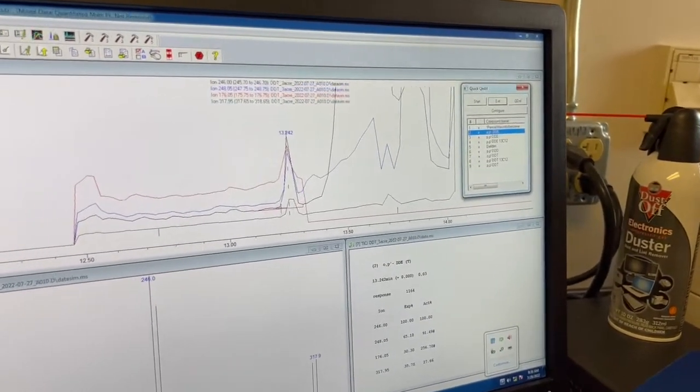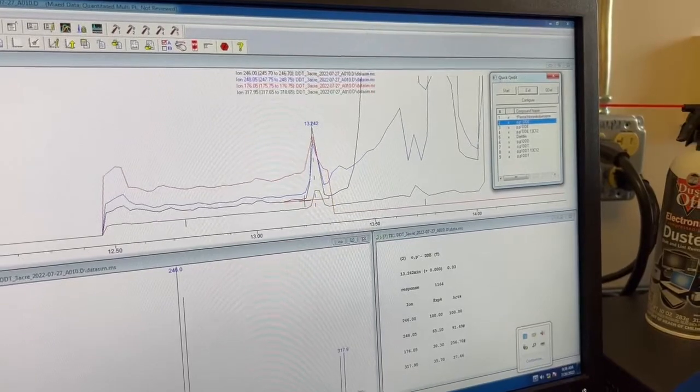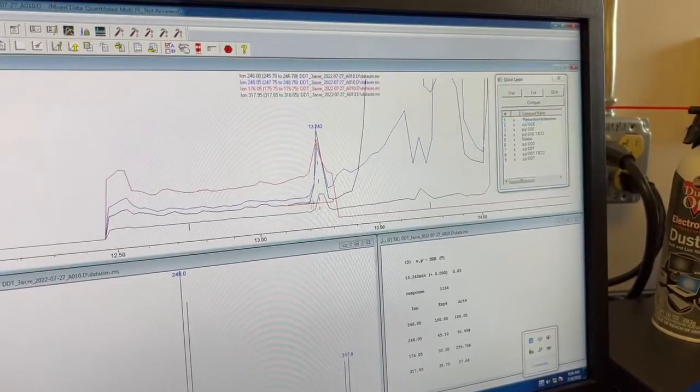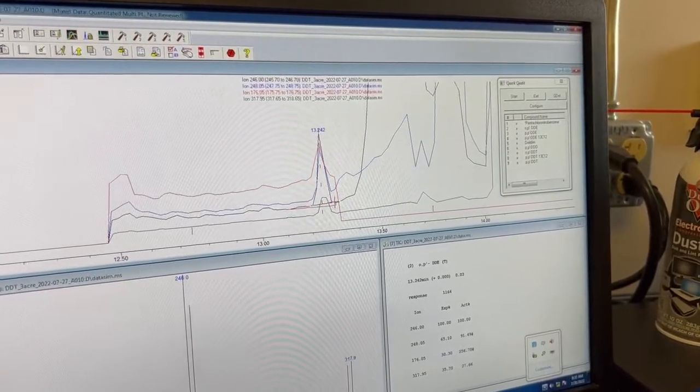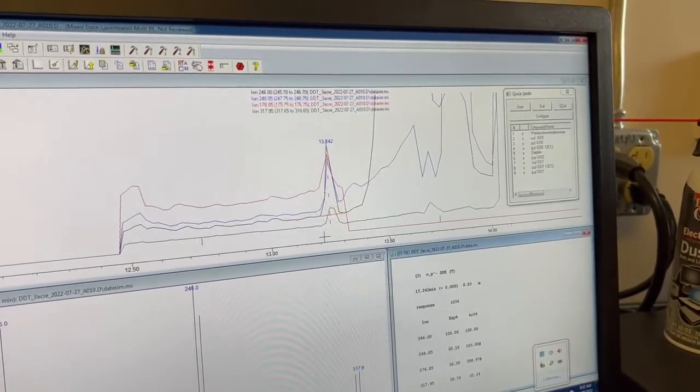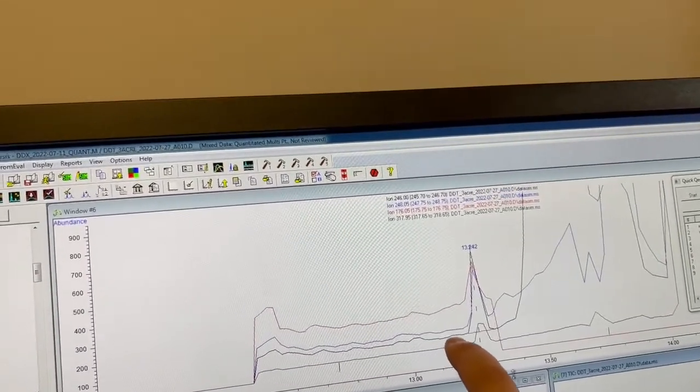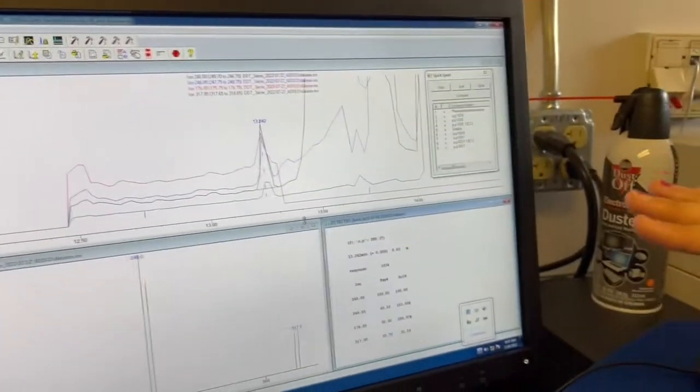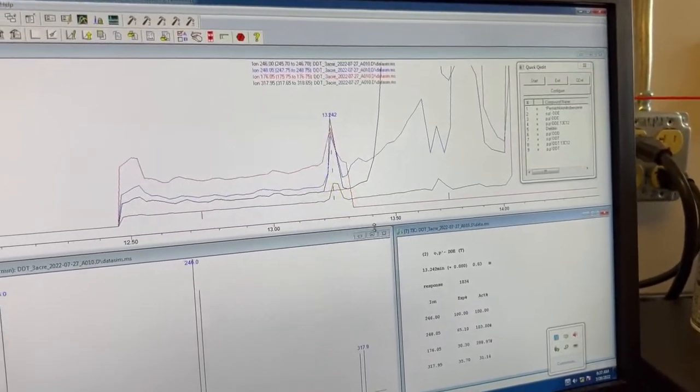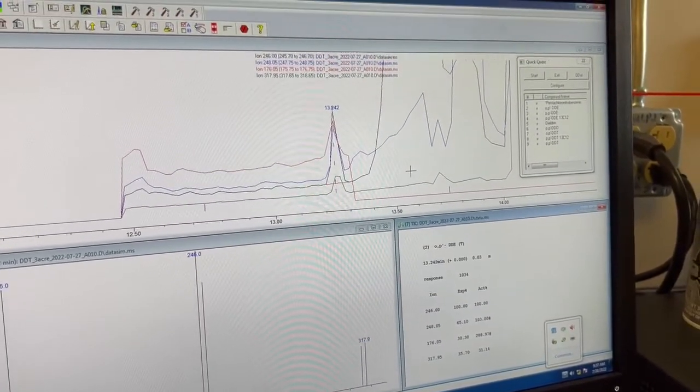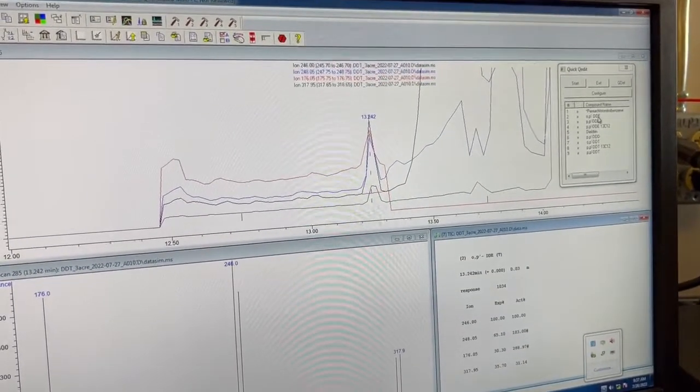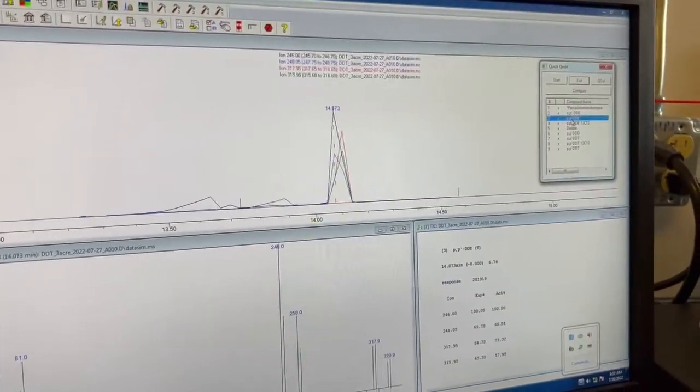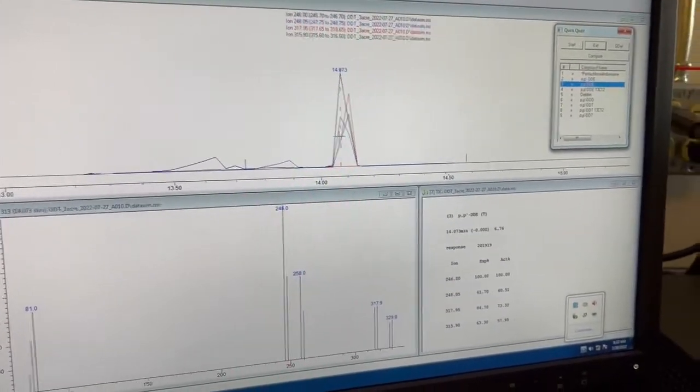The baseline looks kind of flat right now where it's not a huge issue. But you just want to make sure that it's actually integrating what's there. So I would probably put that like there. Because the baseline is supposed to be here and then here or something. It's kind of, it's moving up maybe a little. It's hard to tell. And so this is where it gets a little iffy. You just kind of have to guess. But then you can see like PPDD, clean, perfect, easy.